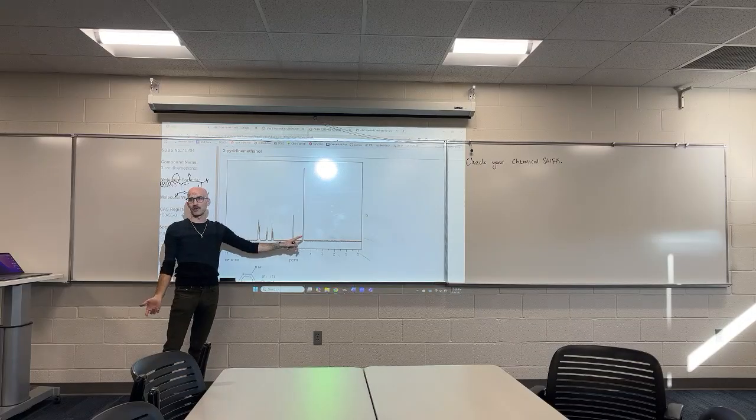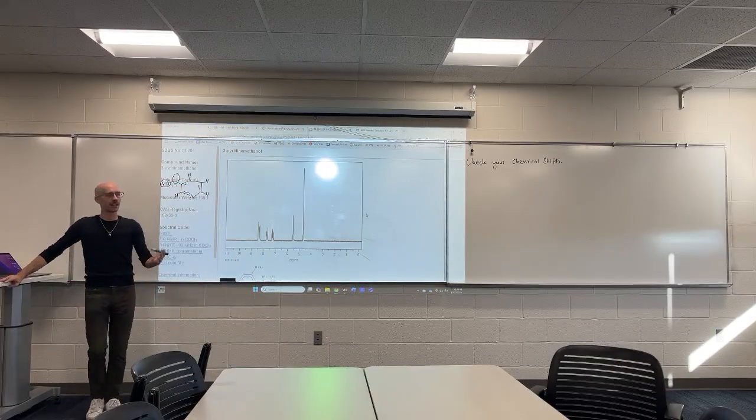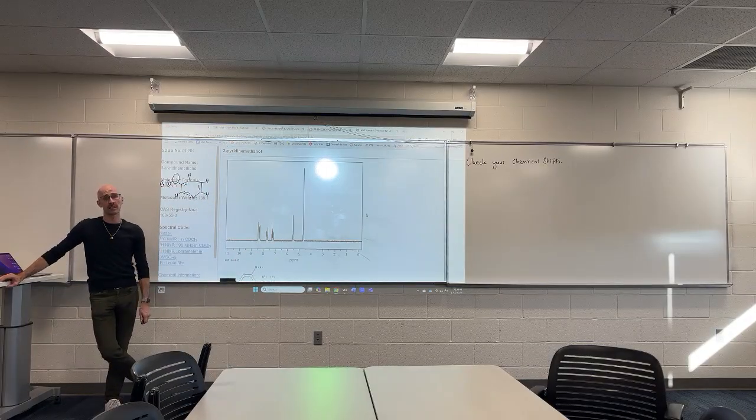but I can't really tell you with certainty if there is actually an alkene and what the functional group is. Couldn't tell you if it's an alcohol, an ester, an ether, a halogen, nothing like that. Just tells you there's something that's pulling electrons away, something that's de-shielding that hydrogen.